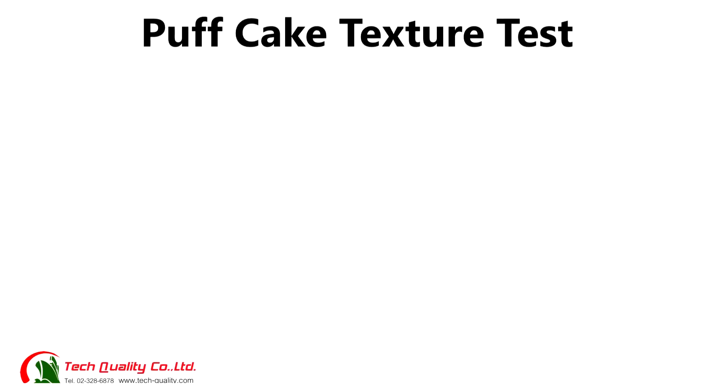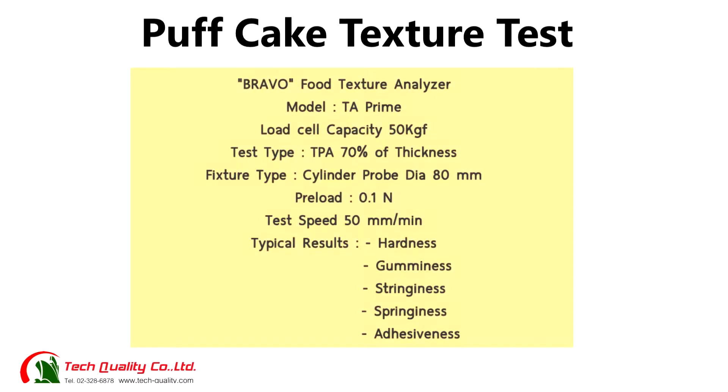Puff cake texture test. Bravo Food Texture Analyzer, model TA Prime. Load cell capacity: 50 kilogram-force. Test type: TPA, 70% of thickness. Fixture type: cylinder probe, diameter 80 millimeters. Preload: 0.1 Newton. Test speed: 50 millimeters per minute. Typical results include hardness, gumminess, stringiness, springiness, and adhesiveness.